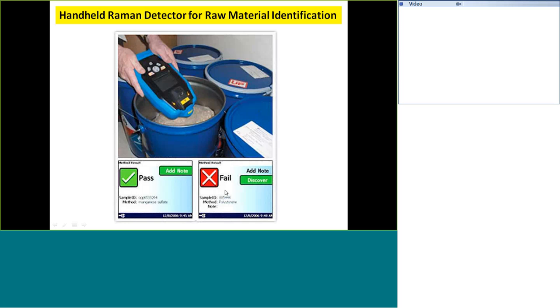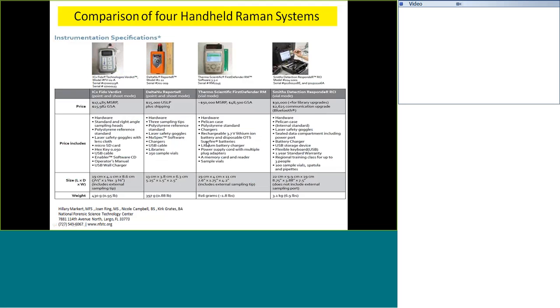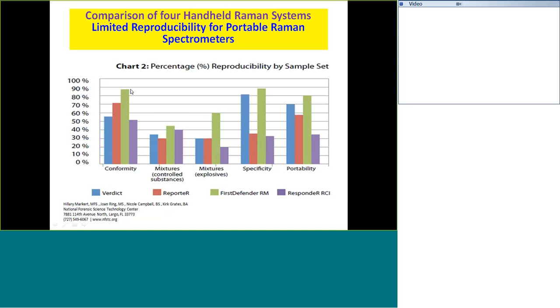Because when you compare to the library data, they cannot directly identify 100%, since it's not pure. You know the equipment, right? I'll tell you the data produced by the Institute of Forensic Science, a national government agency. They compared four handheld systems, and I always say this is a joke. Price-wise, they range from $20,000 to $50,000 from Thermo Finnegan, or to $30,000 from the other company, and those are commercially available. But you pay $50,000 for toys. I classify those as toys.